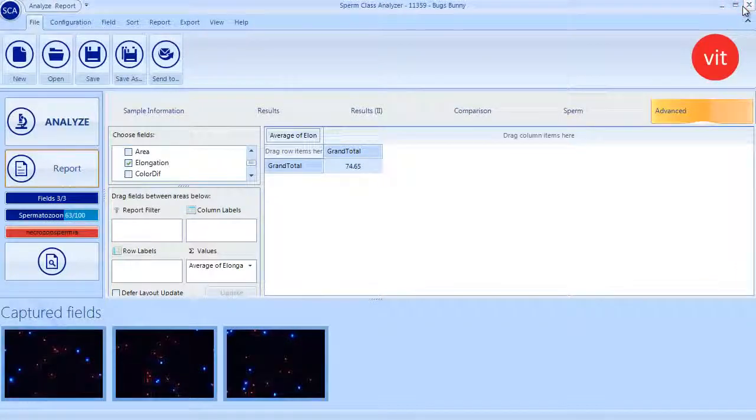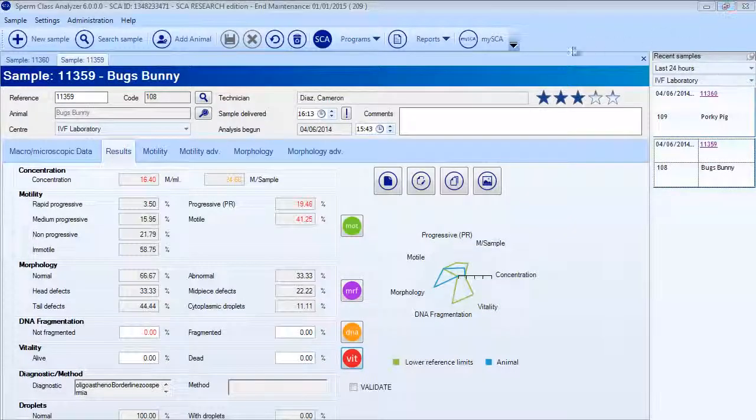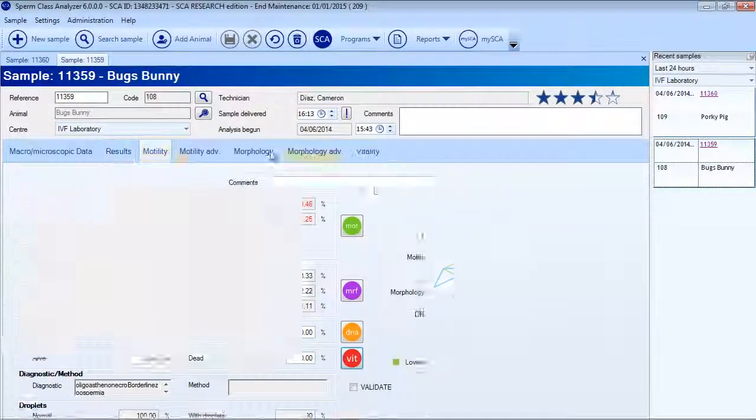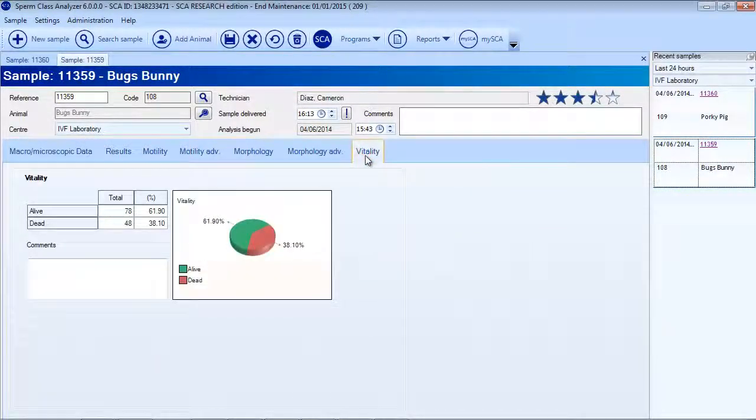The analysis can be saved in the database, thus presented in the Sample Management window, where all the results and graphic are displayed. Furthermore, it is possible to rate the sample and obtain several reports, among other options.